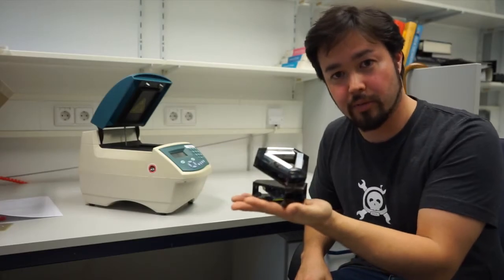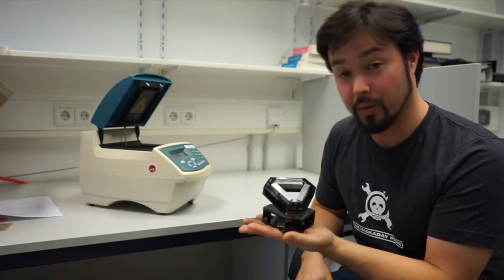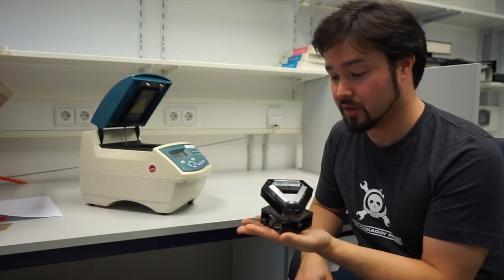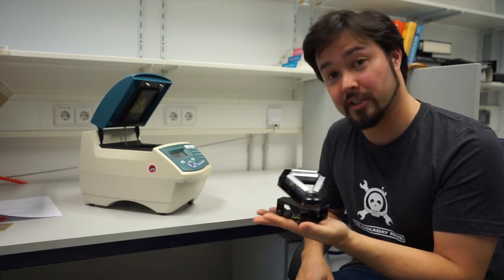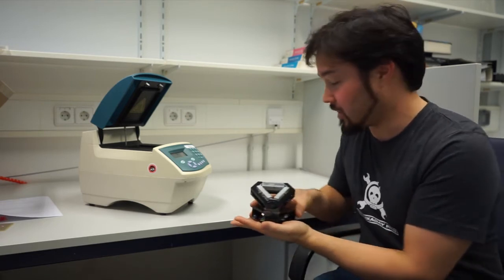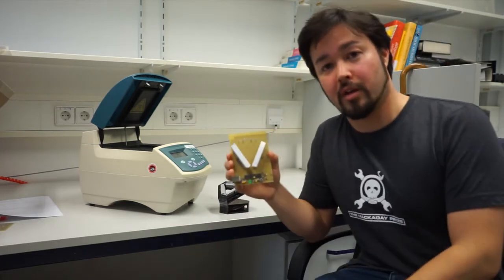This is the device that you can build at home and help join in on the biotech revolution. With it you can do really amazing experiments. You can clone DNA, you can do recombinant DNA experiments, and today I'm going to show you just one of the small things you can do with a machine like this that I'll be doing on the $5 Polymerase reactor.